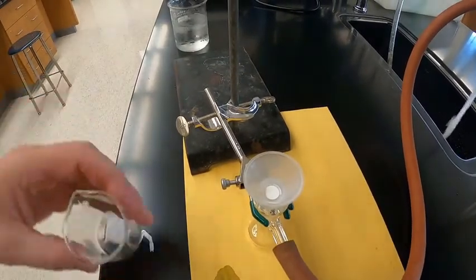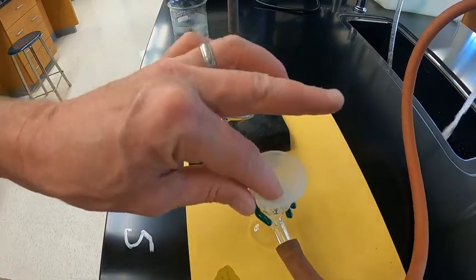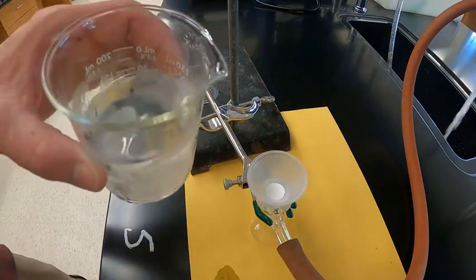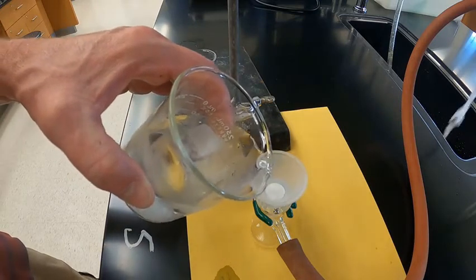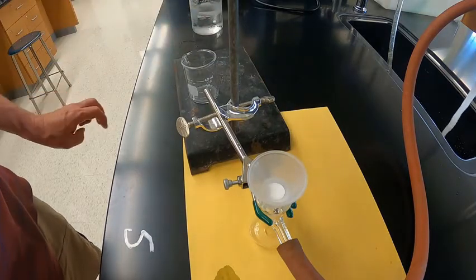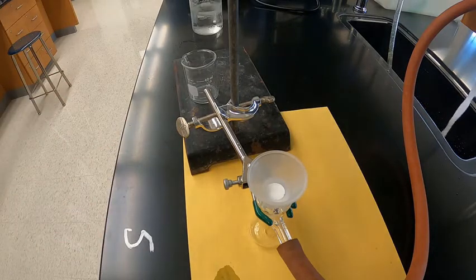Add my piece of filter paper. I'm going to save this beaker for later because I know its mass. So when you put the paper in there, it doesn't stick very well. And if it's not sticking well, when you pour your product in, it could wash under the paper. So I'm going to add a little water, and now you can hear the water sound decreases because now it's creating a vacuum. So it sucked the liquid through really, really fast.